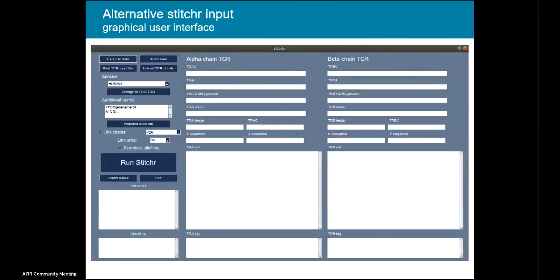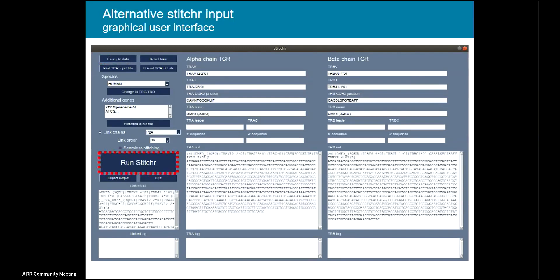That's how it works in the command line. We also have a graphical user interface alternative, which has all the same capabilities and a couple of additional features. It allows you to stitch two chains of a heterodimer simultaneously — either an alpha-beta, or you can click a button to switch to gamma-delta. We've also got options to add any arbitrary sequences to the three-prime or five-prime of your rearrangements if you want to add cloning sites, stop codons, or P2A sequences, whatever you like. It's very straightforward — clicking the example data populates it with combinations, and when you click run Stitcher, it outputs full coding nucleotide sequences for the alpha and beta chains. There's also a link-chains option that joins the two sequences by any sequence you like; by default it's a P2A skip sequence, so you can generate a bicistronic, synthesizable, expressible construct in seconds.